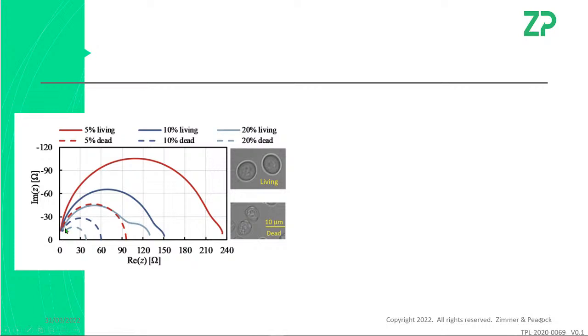So I find their results would be in line with my expectation that when you have a high integrity of cell wall, you do have a higher dielectric or higher capacitance. It's because of the cell walls. When the cells are dead and maybe those cell walls don't have the integrity, then the capacitive nature of it decreases. So that was in line with my expectations.